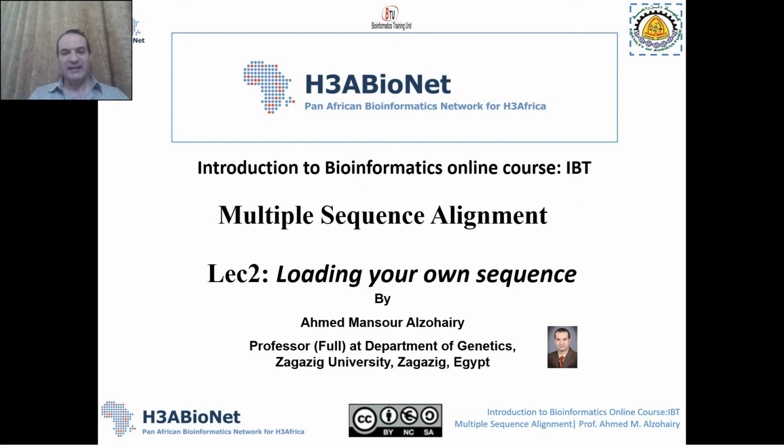Good morning everybody and welcome to Multiple Sequence Alignment second session, part 2 of loading your own sequences into Jalview.